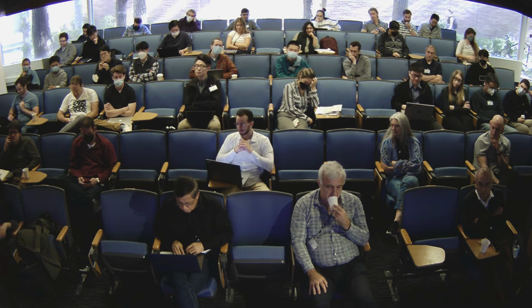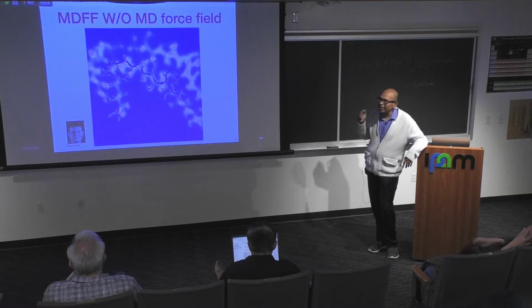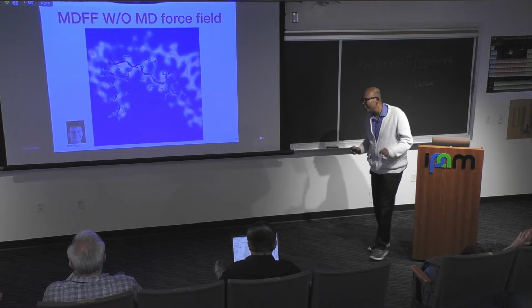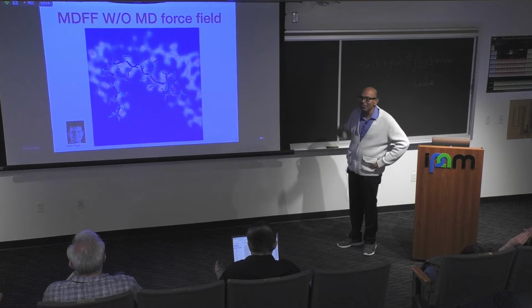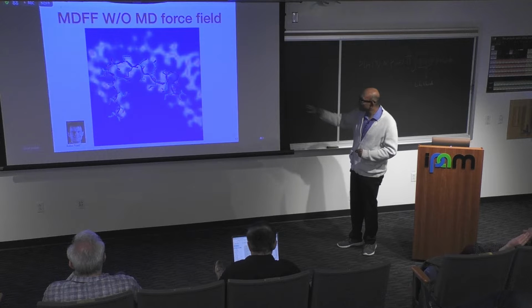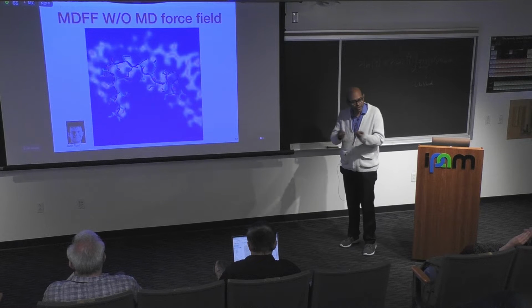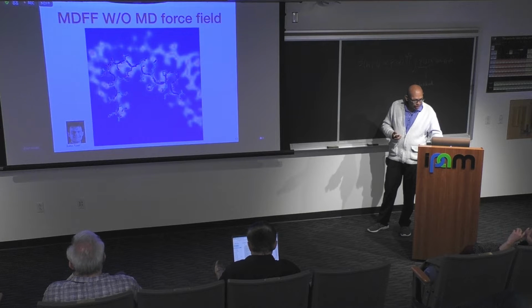But at least in the context of MDFF, if you do all of these kinds of data-guided MD simulations, you take molecular dynamics simulations and remove the force field from the simulation. Simply ask the atoms to be particles and push them inside the density. You get these sort of structures. Of course, force fields are there that prevent it from happening. But then we wanted it a little more clear.